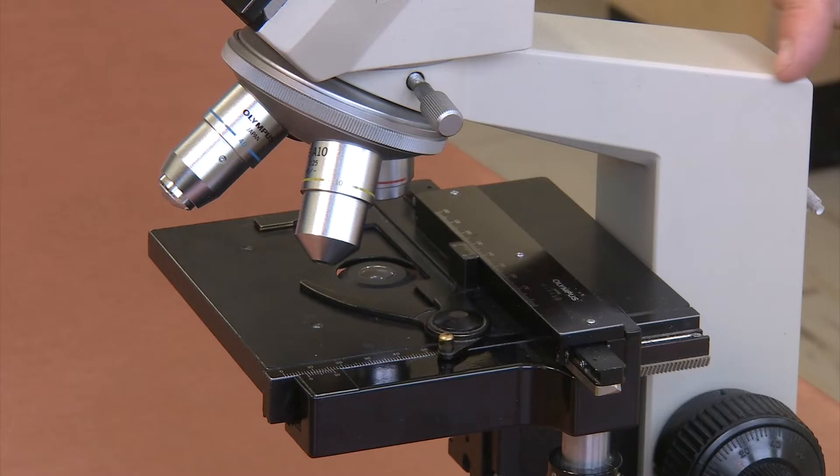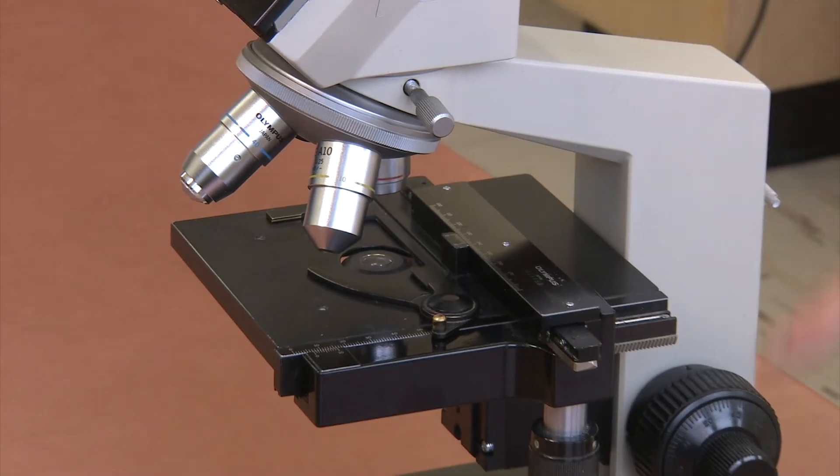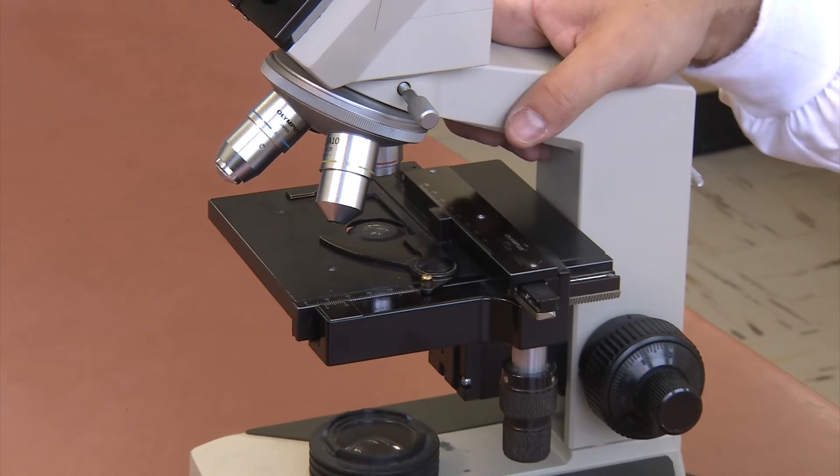All of these parts are attached to the arm of the microscope, which runs from the binocular tube to the base of the microscope.